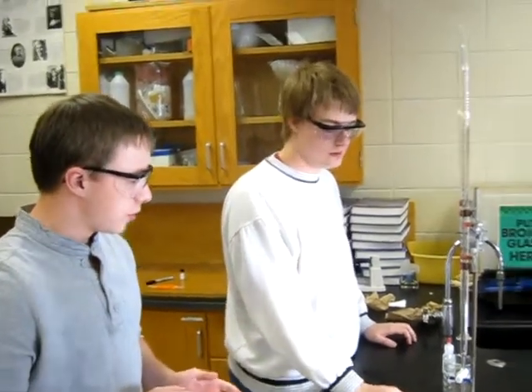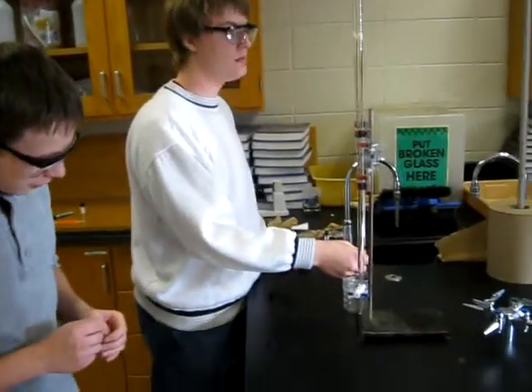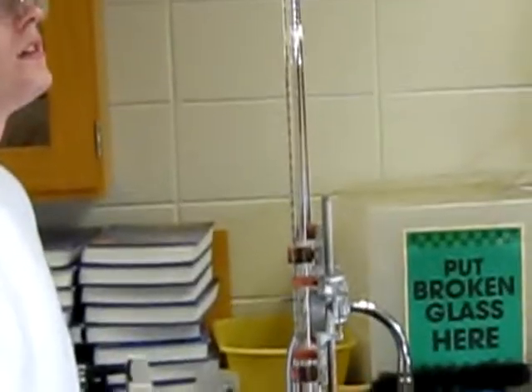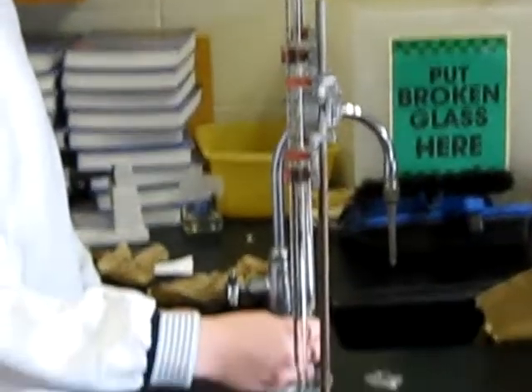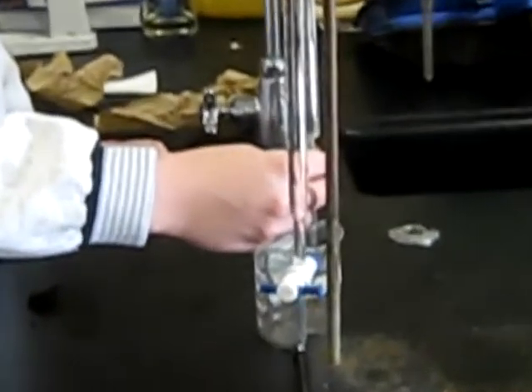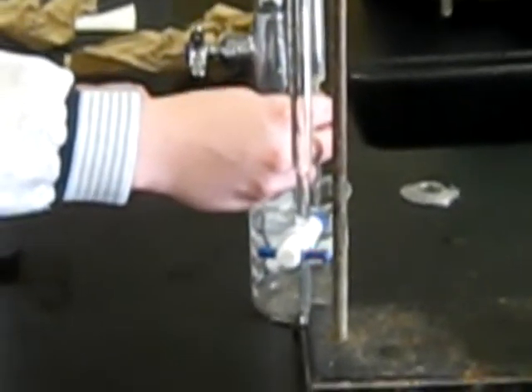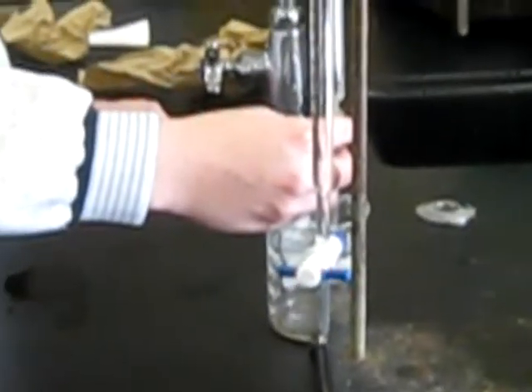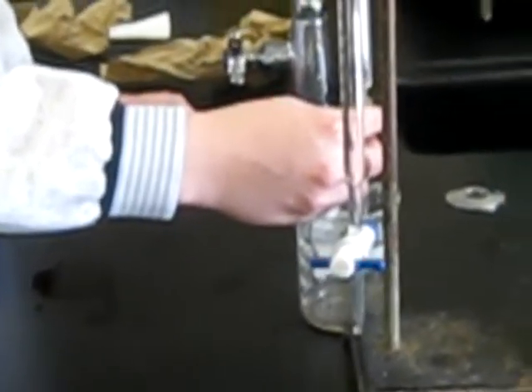My partner here is going to begin adding 10 milliliters of acid into the beaker. We want to make sure, be very careful, that we only add 10, and we want to make sure that we write down exactly how much we add in.